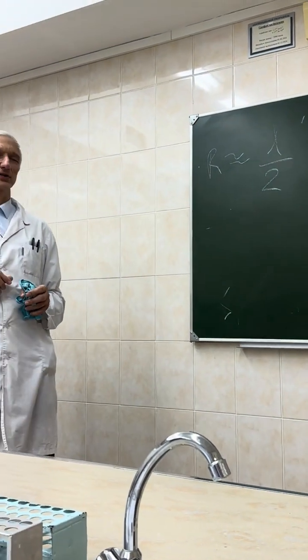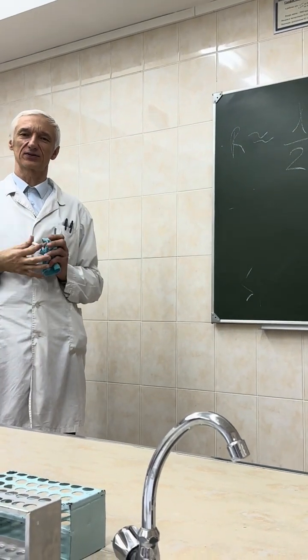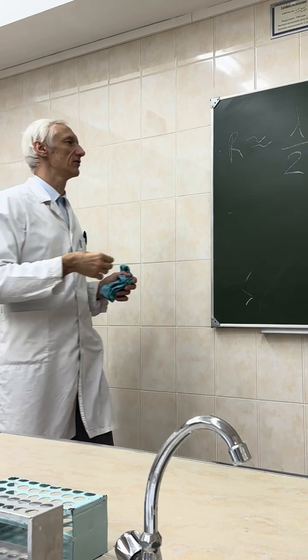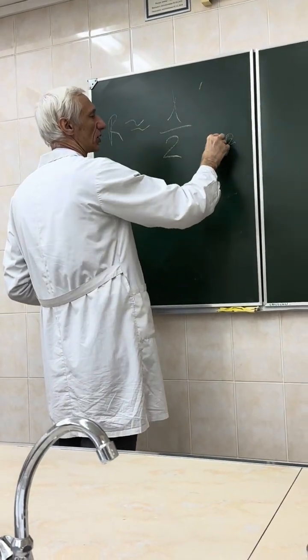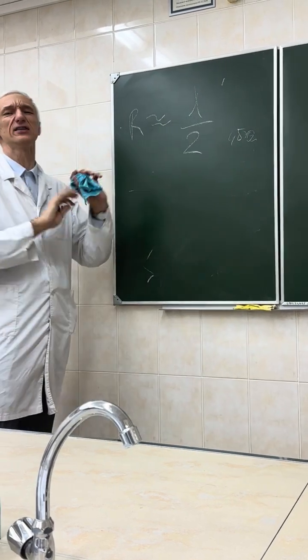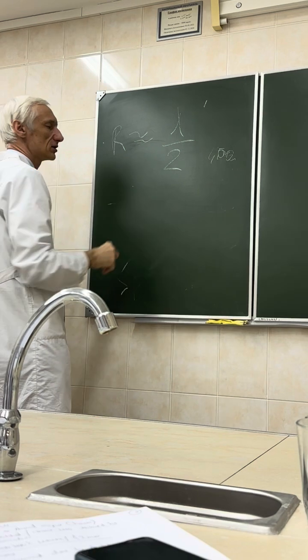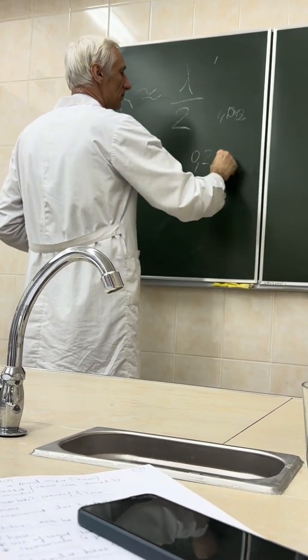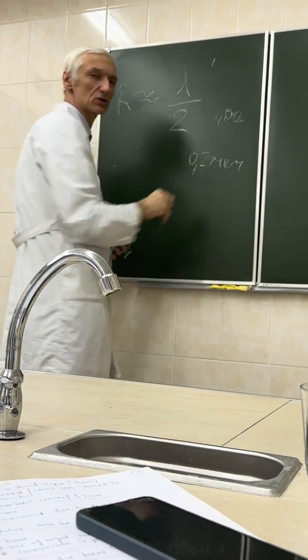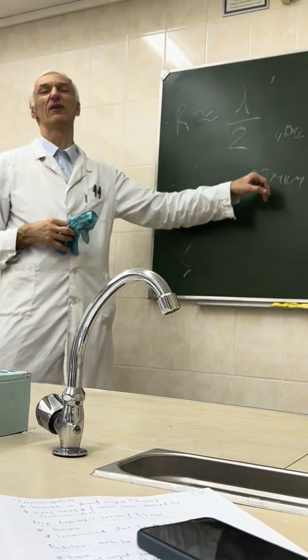It's a subject of discussion whose eye looks better in UV light. Officially I saw that even visible light finishes somewhere at 400 nanometers. My opinion, it should be 450, it will be blue really. It depends. So if we consider 400 nanometers divided by 2, we will have 0.2 micrometers, which is the theoretical resolving power. In reality, with the help of various tricks, it is possible to reduce it to 0.15.